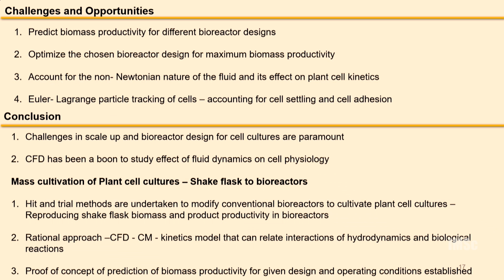So in conclusion, the challenges in scale-up and bioreactor design for cell cultures are paramount, and CFD has actually been a boon to study the effect of fluid dynamics on cell physiology. So with respect to plant cell cultures moving from shake flask to bioreactors, generally hit and trial methods are being taken to modify the conventional bioreactors. So reproducing shake flask biomass productivity in the bioreactors is a key problem right now.